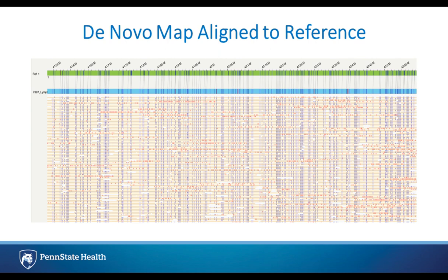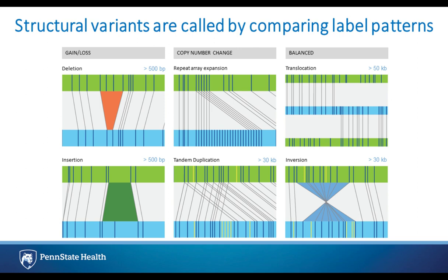And so the sample, so the cancer sample, for example, is shown in blue. And the lines on the blue are the staining pattern. And then you can see that in green is the reference. So for what I do, it's typically HG38, also has the banding pattern, and any differences that are detected can be used to decide the presence of structural variants. And all the images you're seeing on the bottom there in orange are just examples of these digital molecules that span the region.